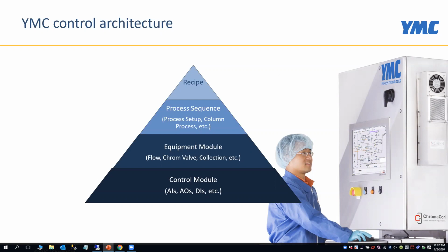So an example would be a group of valves working together to, for example, open the inlet channels or outlet channels, or make a pump use a certain point as its flow point, which is based on an analog device. The next level of automation is the process sequences. And this is the second highest level.